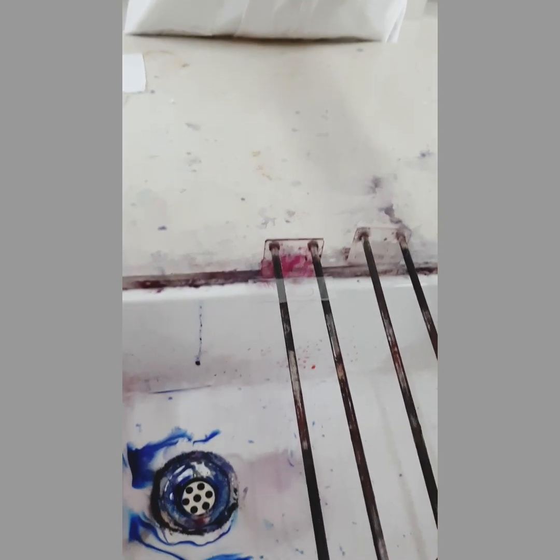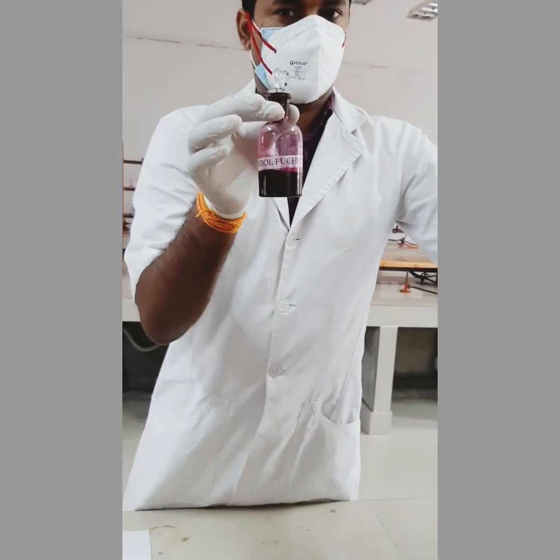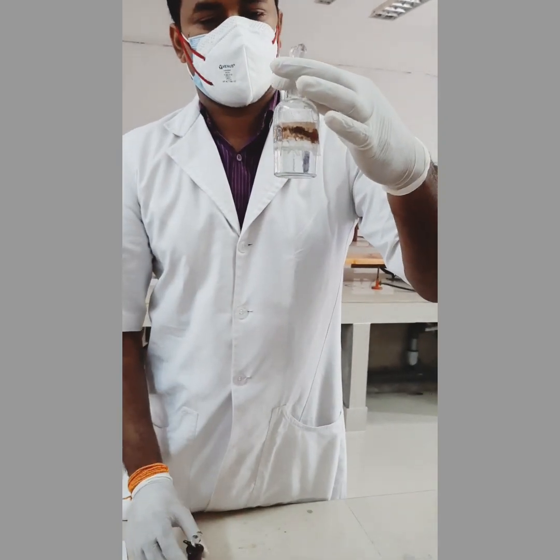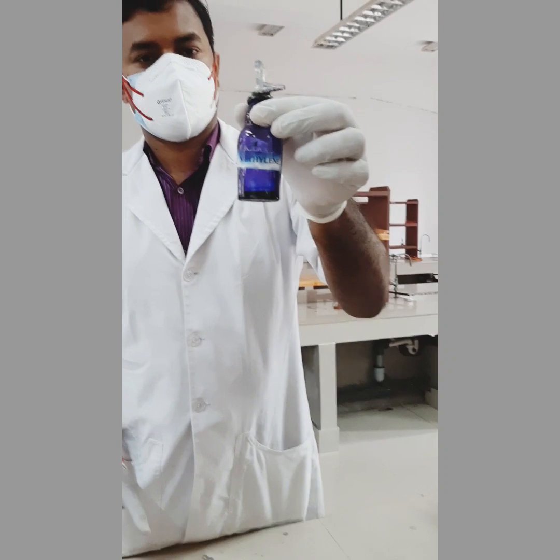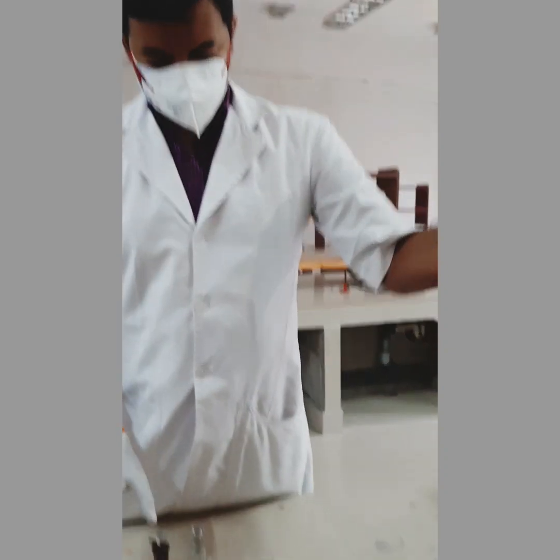So primary staining, here we are using carbolfuchsin. First I will introduce the stains used. First one is Ziehl-Neelsen carbolfuchsin. Then the decolorizer used is 20% H2SO4. As it is a differential stain, we have to use a secondary stain or counter stain, that is Loeffler's methylene blue.